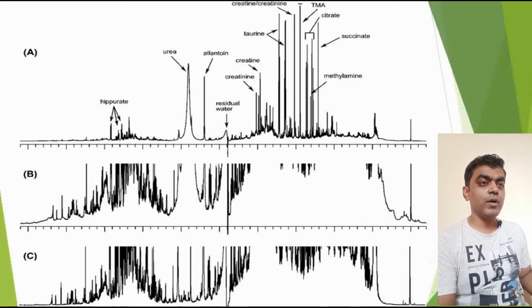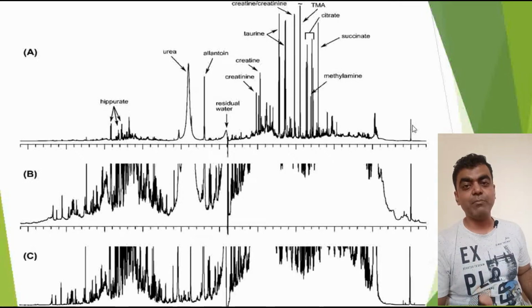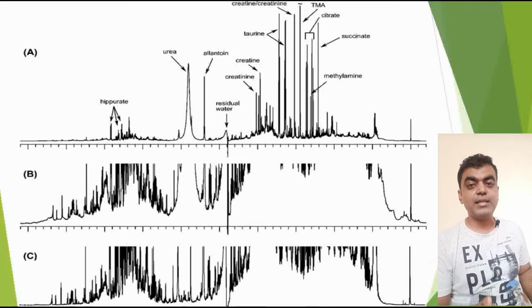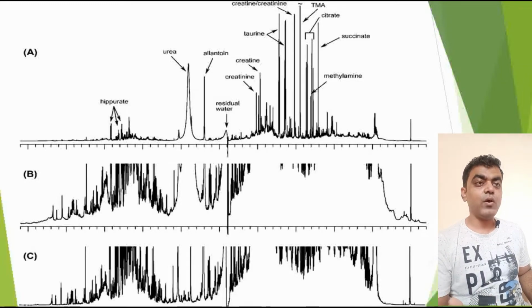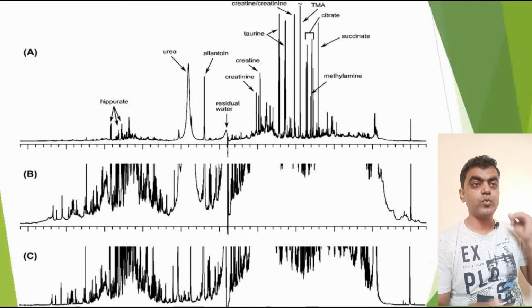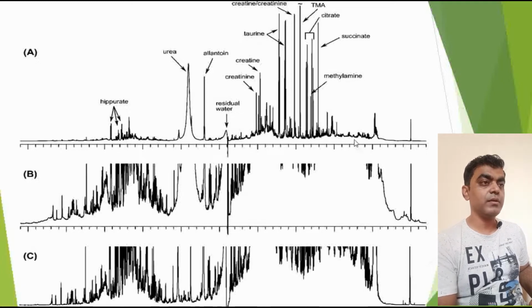So just to give you an understanding, this is basically at 0 ppm. At 0 ppm you have the reference peak. This reference is the reference compound which you are using. It can be tetramethylsilane, a silane which has 4 methyl groups, right? All these 4 methyl groups together, all the protons, will give you only one peak. So we adjust this one peak to the 0 ppm position in the chemical shift scale, and then the rest of the spectrum gets aligned based on its respective chemical shift positioning.